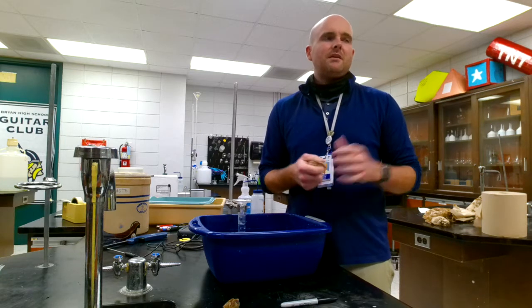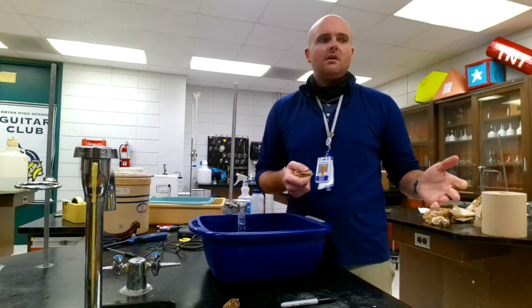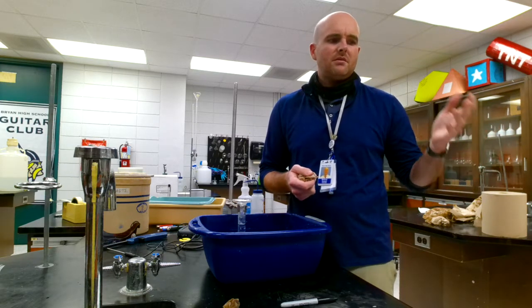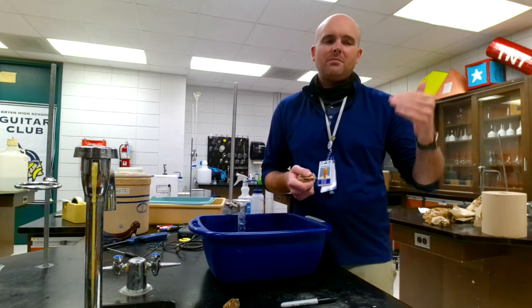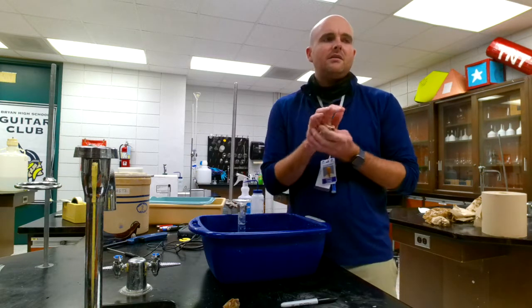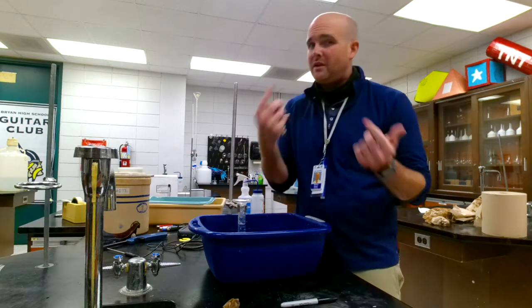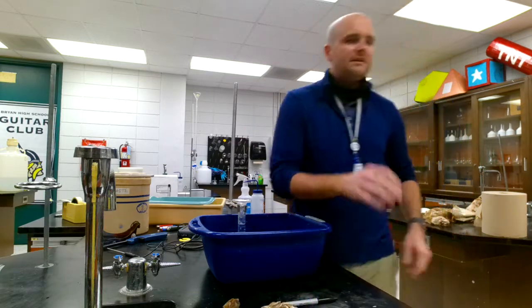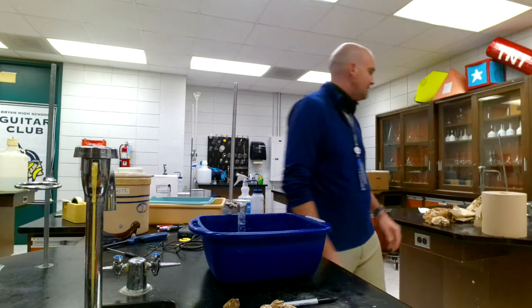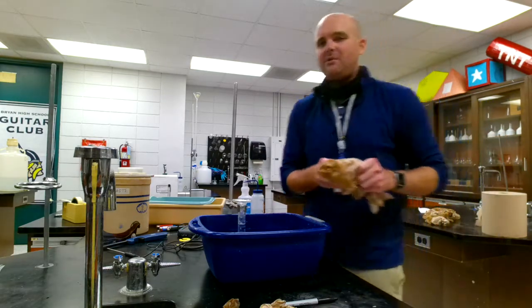So if your answer ends up being 40 grams per mole, is it really going to matter if you're plus or minus 1 or 2? Not really. You're trying to get in that range. You probably have a good idea of what gas is in there. This is still a high school experiment, so that's why we're doing that.